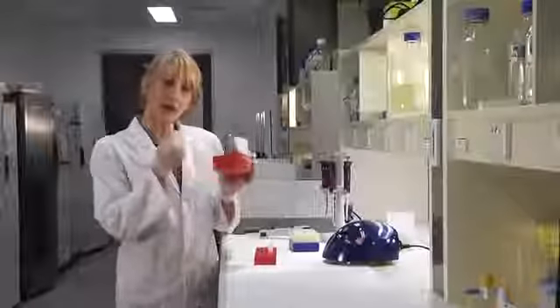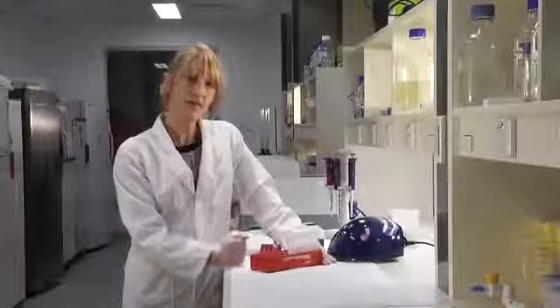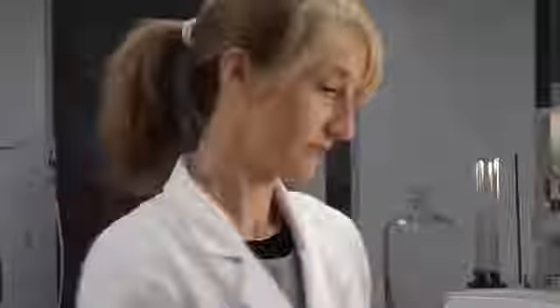So each of these bacterial cultures has grown from a single bacterial cell, each one containing a plasmid from our ligation mix. So we'll go and extract the plasmid so that we can check which ones contain the insert. To separate our plasmid from the other components of the cell, we'll rely on its unique solubility. First, we need to separate the bacterial cells from the culture media, and we'll do that by centrifugation.